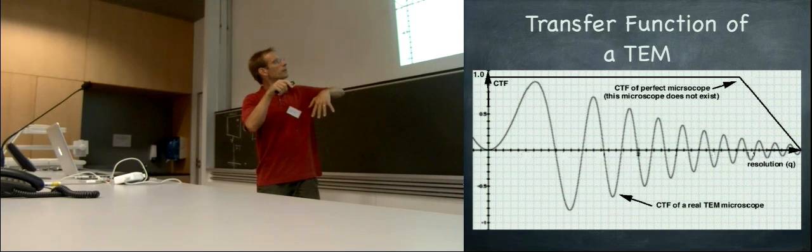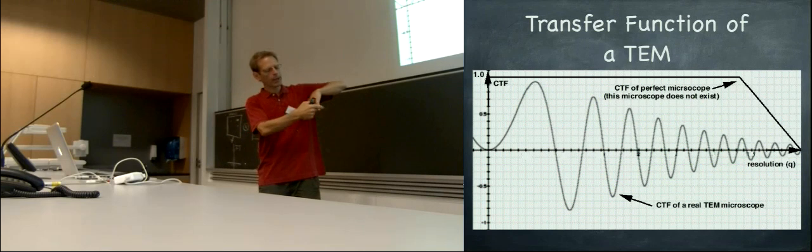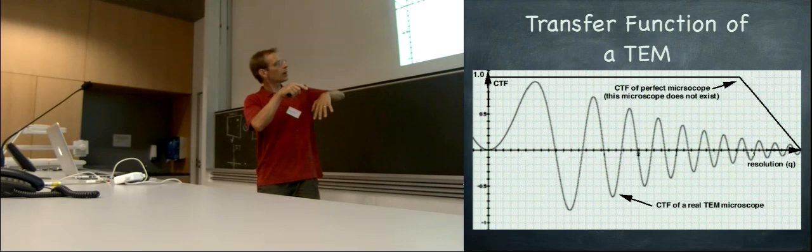And if you have bad luck, then the high frequency detail, depending on how I put my fingers, is just this frequency because they are closer together. And then the contrast transfer function is negative, and instead of having white, black finger, white, black finger, white, black finger, we have the opposite, which is black, white finger, black, white finger, black, white finger in the picture. And then you would take the picture and count and say that person has 6 fingers.